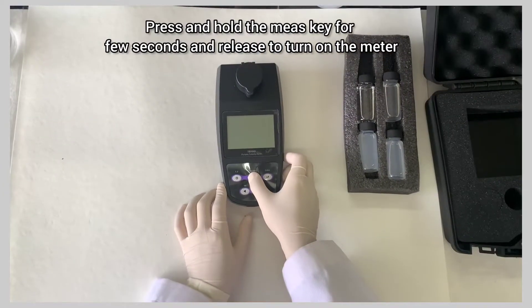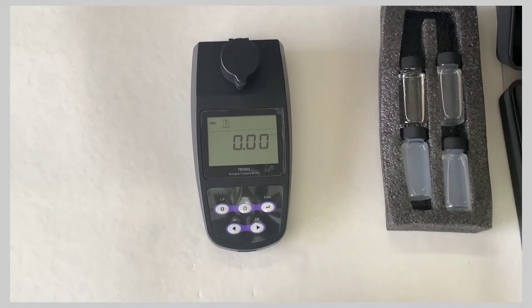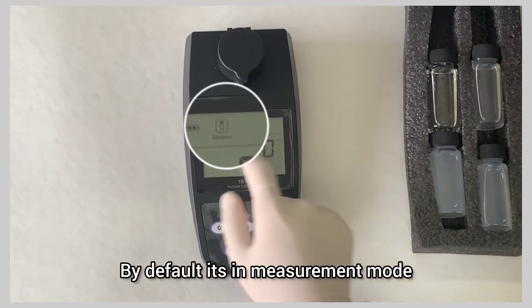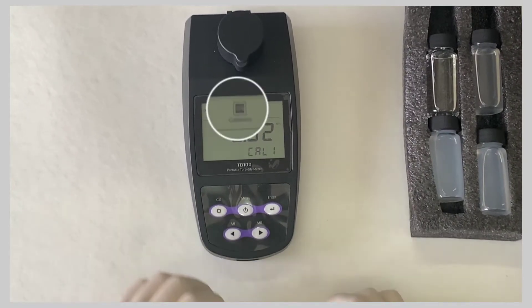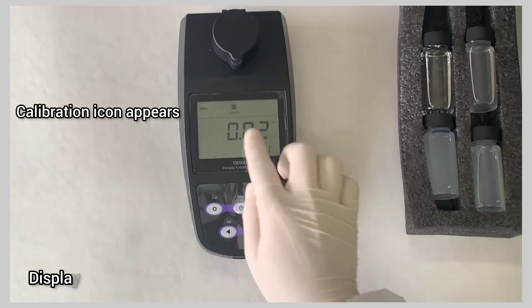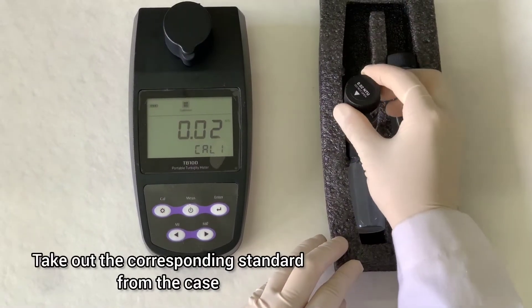Press and hold the MES key for a few seconds and release to turn on the meter. By default it is in measurement mode. Press CAL key to calibrate the meter. The calibration icon appears and the display shows 0.02 NTU.